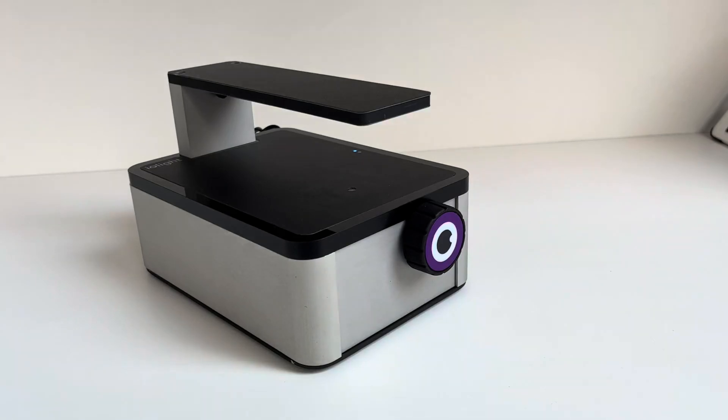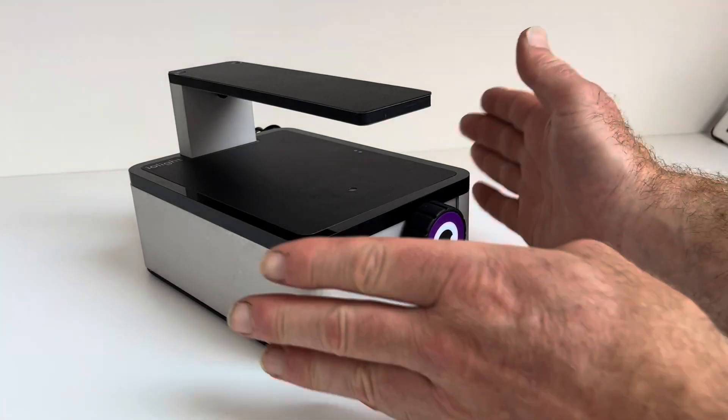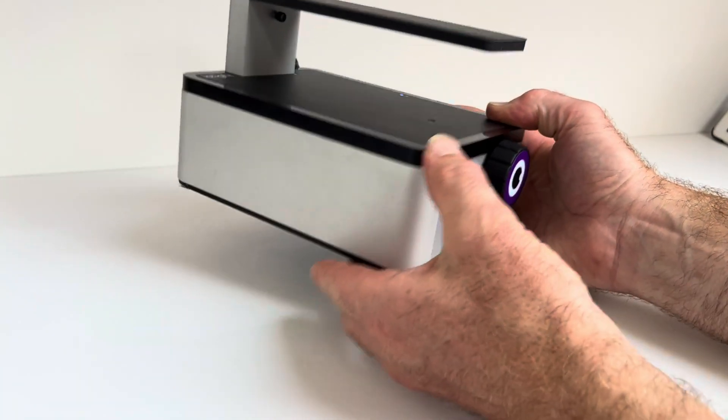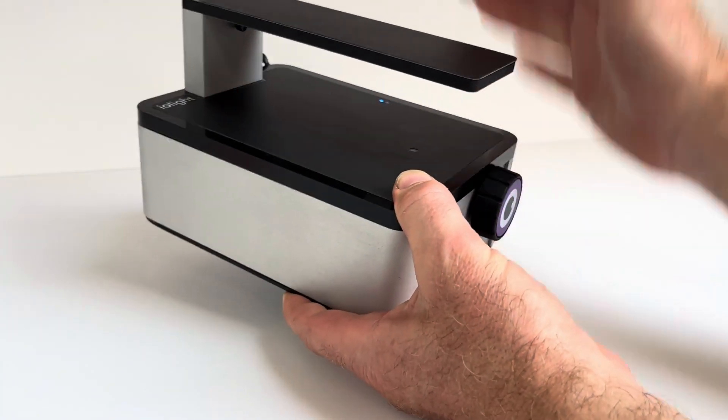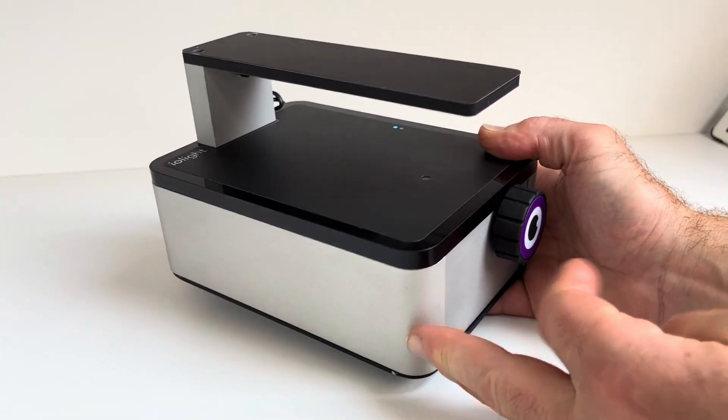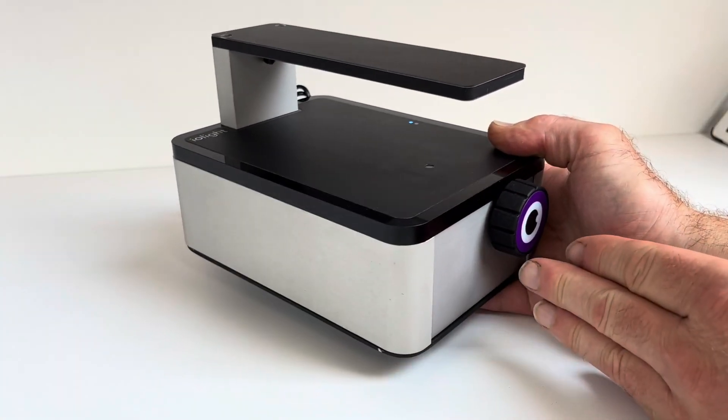Hello, this is Richard from iolight. I'd just like to tell you about our new compact fluorescence inverted microscope. The microscope is very compact and it's all sealed so that you can use it inside an incubator, a CO2 incubator or a glove box, and of course that means you can disinfect it and clean it very easily.